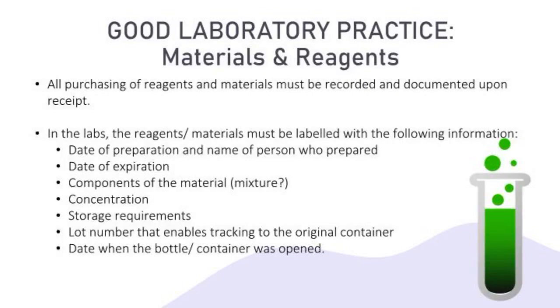Besides equipment, all the materials and reagents used in the study must also be handled in a systematic manner. The process of purchasing must be recorded and documented once the items are received. The labels of the reagents or materials should include the following information: the date of preparation and who prepared it, the date of expiration, the components of the material if it is a mixture, the concentration of the reagent, the storage requirement such as whether it needs to be stored at refrigerated temperature, the lot number which allows tracking back to its original container, and the date when the bottle or container is opened if the chemical is used straight from its original container.